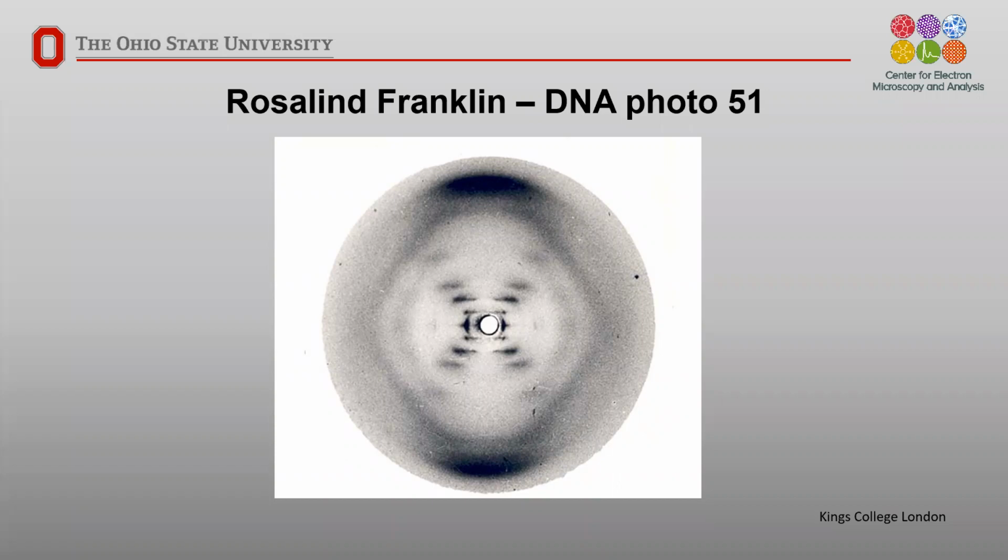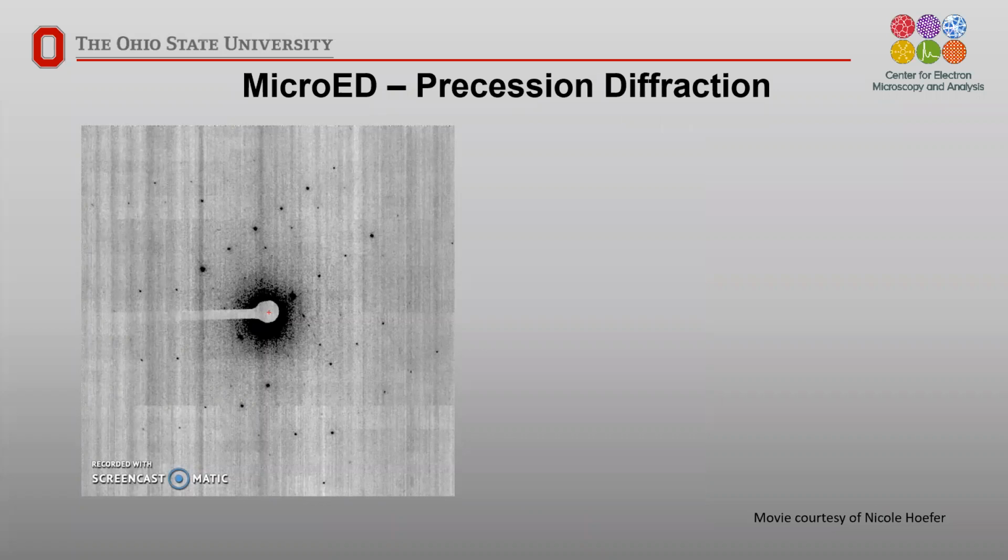Well, here we have been starting to work on a new technique known as micro electron diffraction, which is a precession diffraction technique. So we can actually work with crystals that are micron size and smaller and actually pull out the same kind of information that you do with X-ray diffraction on some of these larger crystal sizes.